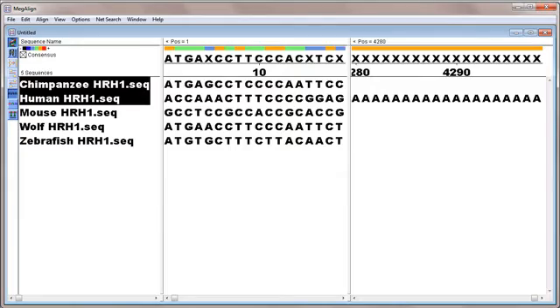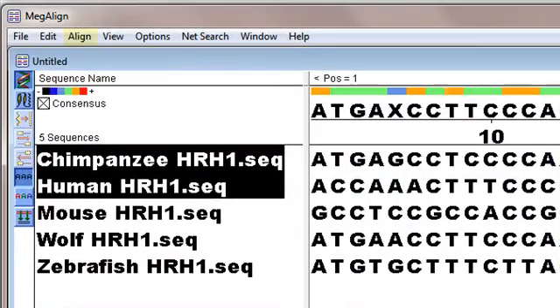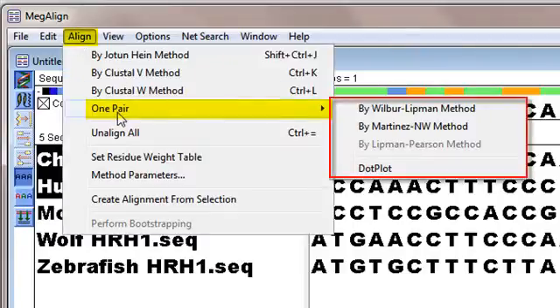Now that I've made my selections, I need to choose an alignment method. By going to the Align Method and choosing One Pair, we can view the available pairwise alignment methods.